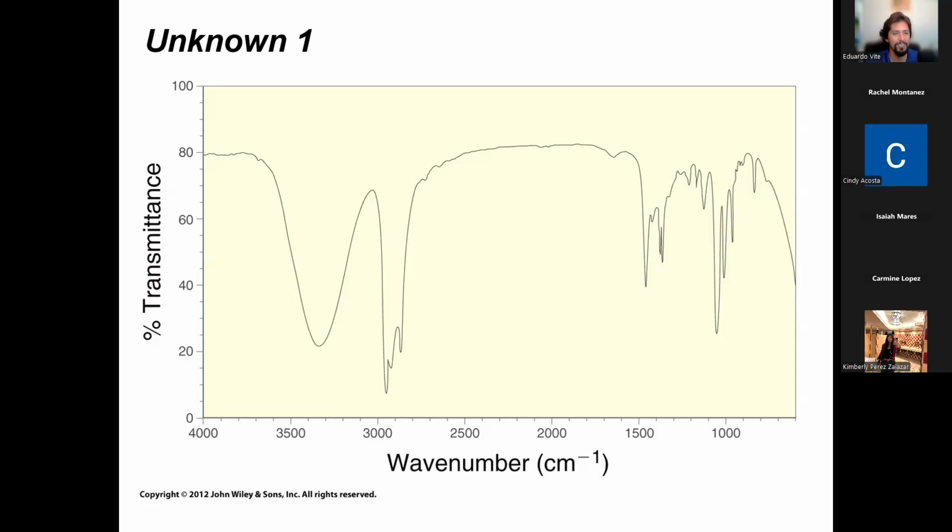So yeah, good question. For example, here, one thing stands out right away. What's the first thing you would go to when you see this? CH, okay. And where's the CH at? So definitely CH. Ruben is saying OH, Rachel is saying OH, right? Both of these are here. Exactly. So give me the wave numbers.